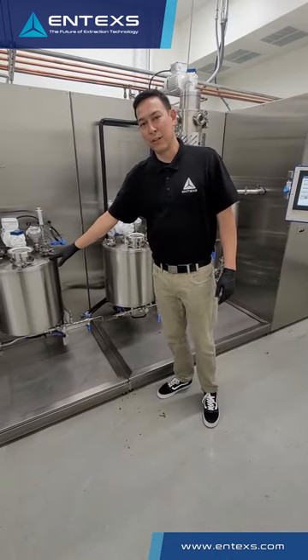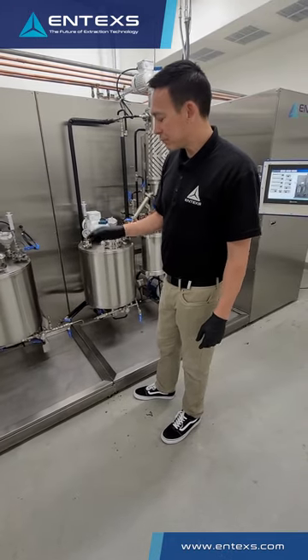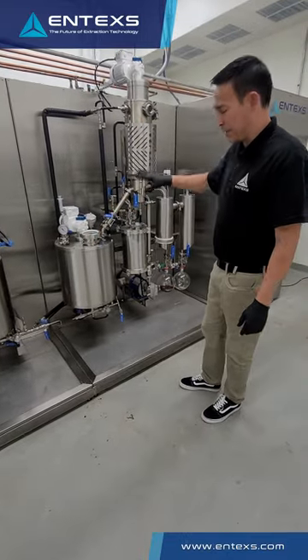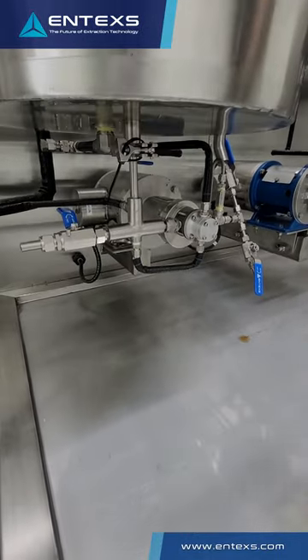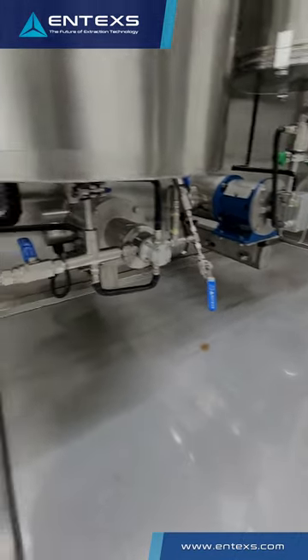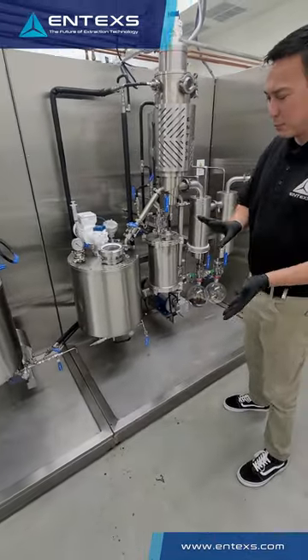After crude oil is created and solvent evaporated, that oil becomes very viscous when cooled. So from this point on, everything that is pumped and all of the flow paths for the product are thermally jacketed. So when you actually start a pump, everything flows. You do not have to use heat guns or thermal tape to run your process.